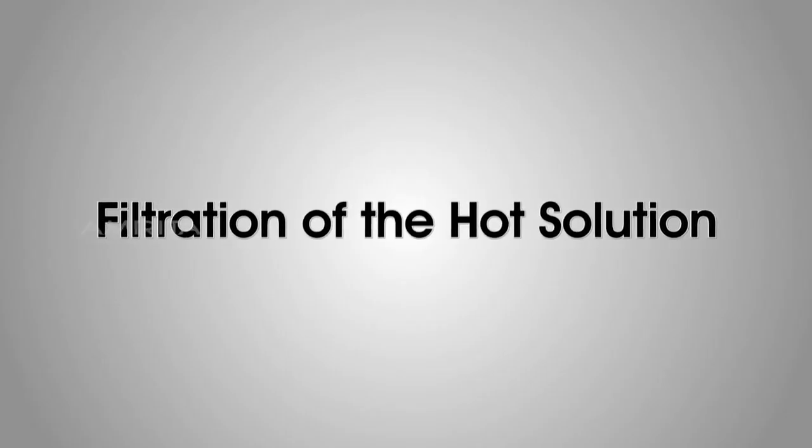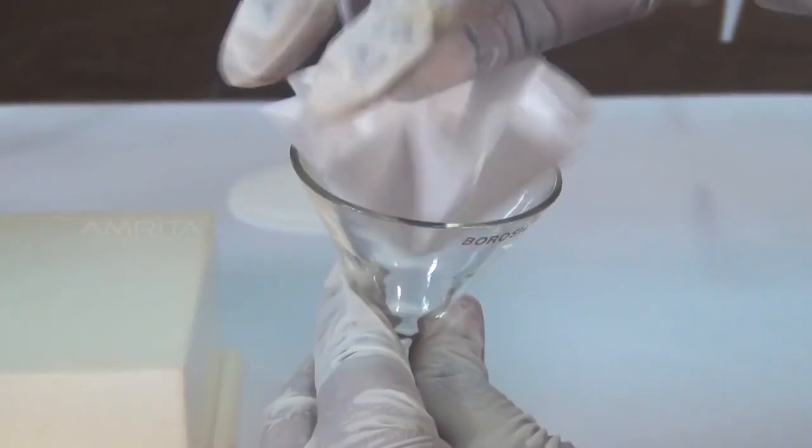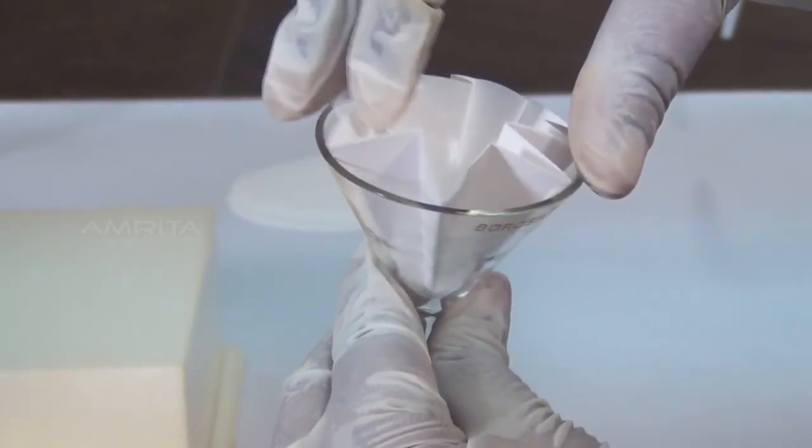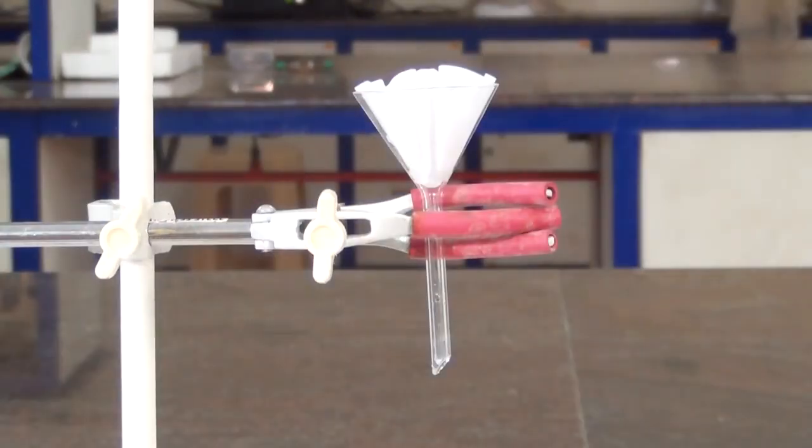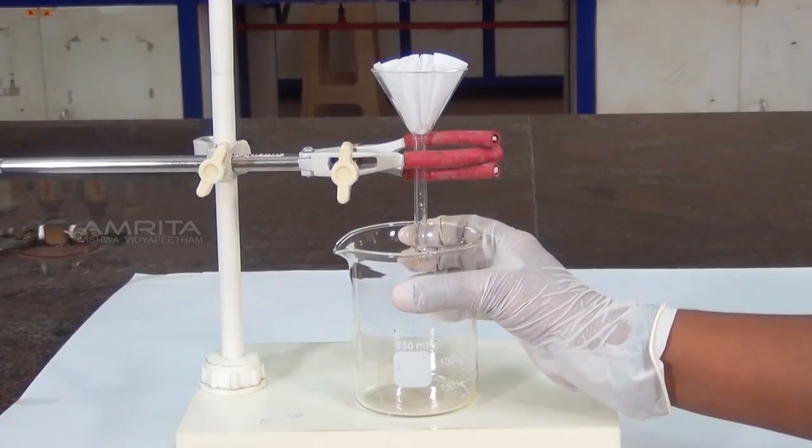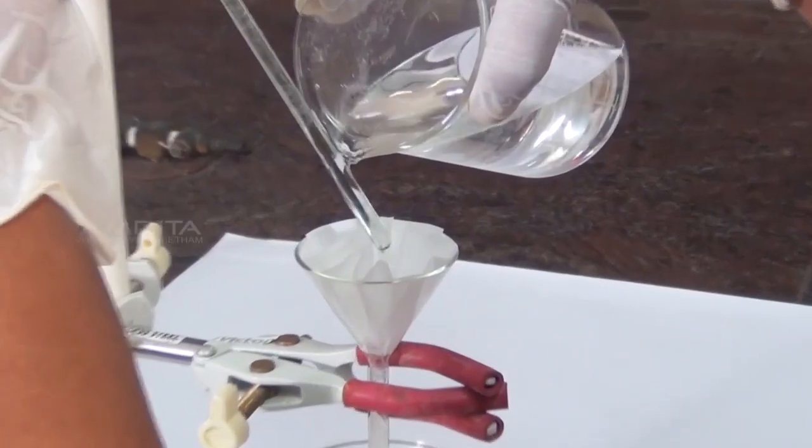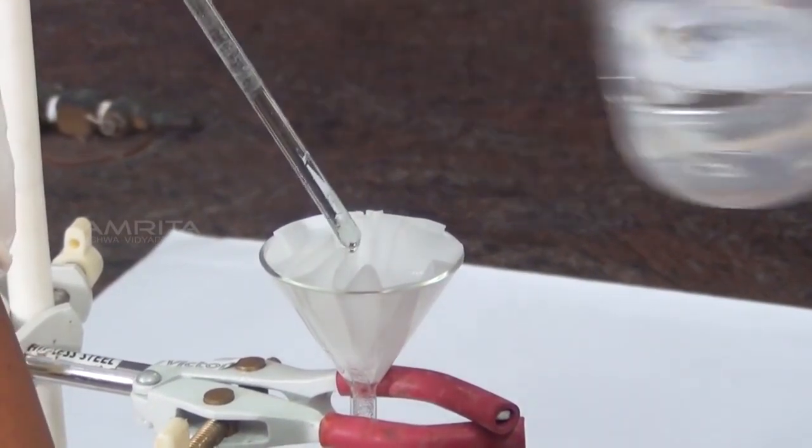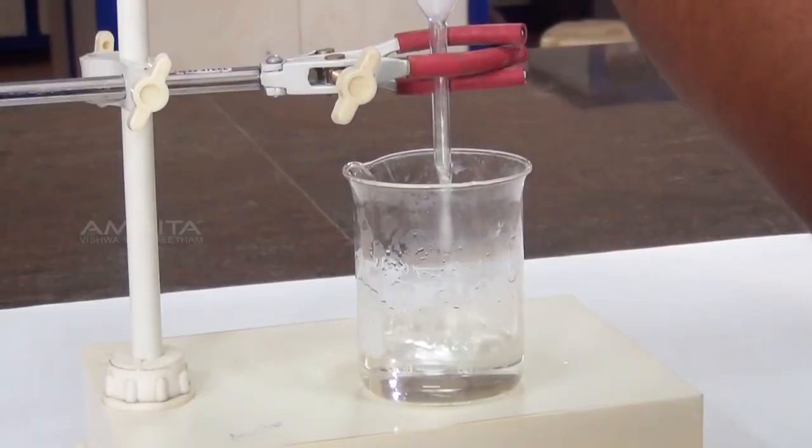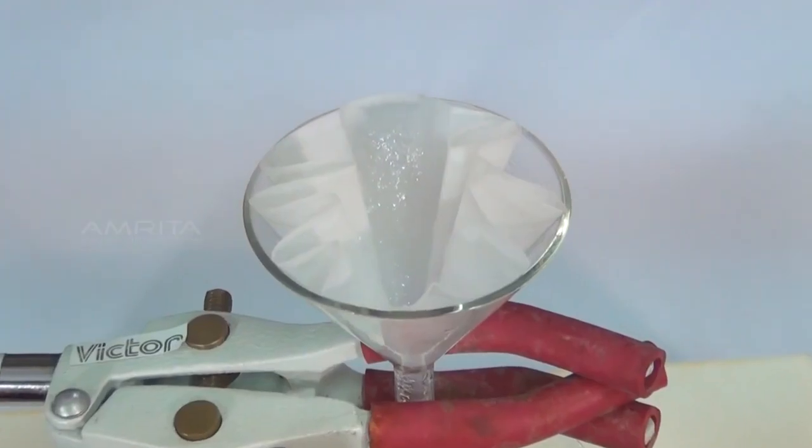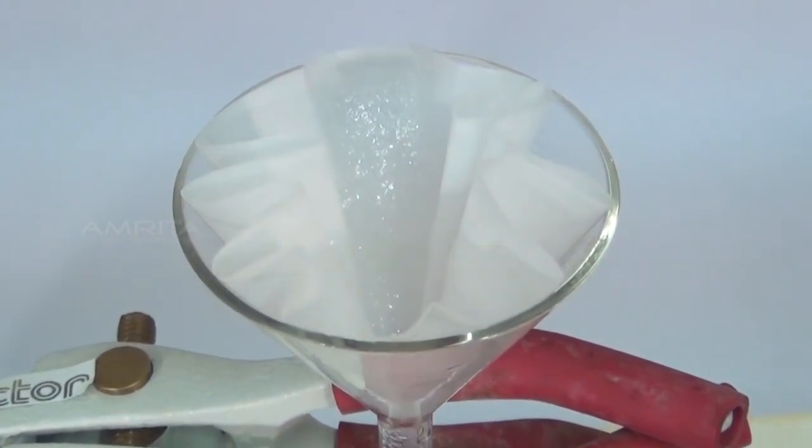Filtration of the hot solution: Place a fluted filter paper in the funnel and clamp the funnel to the stand. Place a beaker under the funnel. Pour the solution into the funnel over the glass rod and collect the filtrate in the beaker. The insoluble impurities are left on the filter paper.